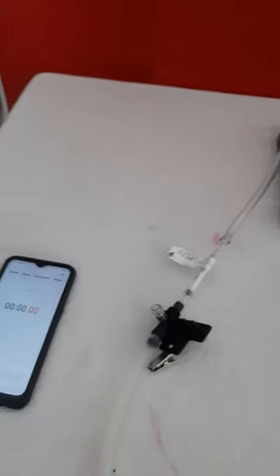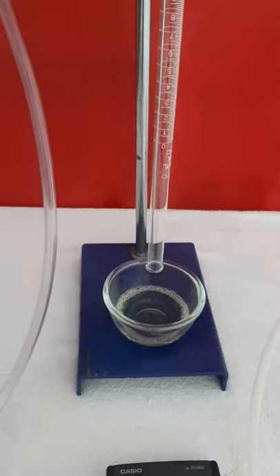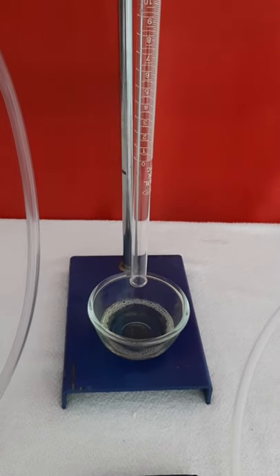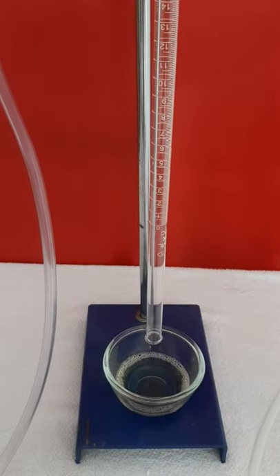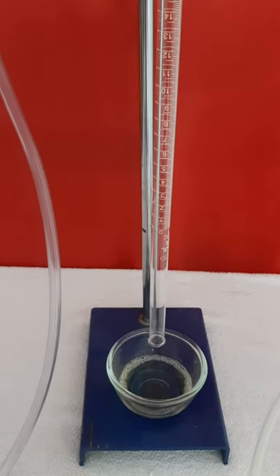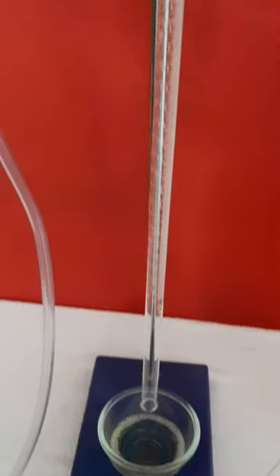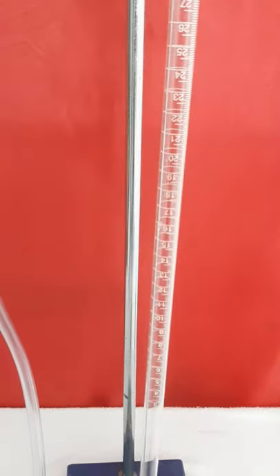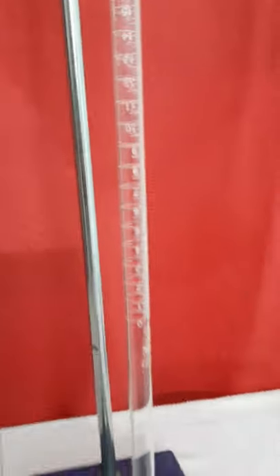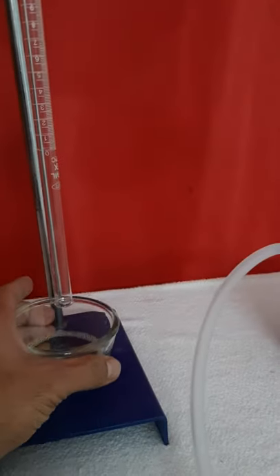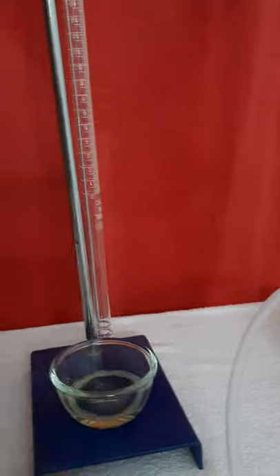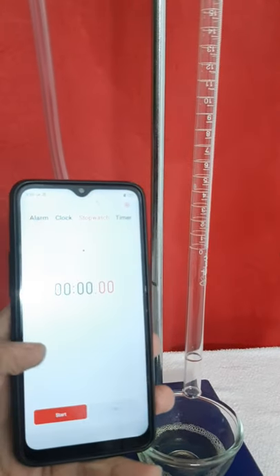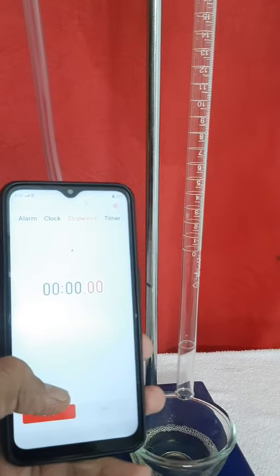What we're going to do is when we put this solution on the burette and it reaches 0, we'll start our stopwatch. Then when it reaches 20, we'll stop the stopwatch. So let's do it. Turn on the stopwatch when it's reaching 0.